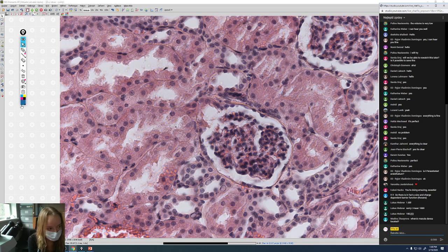And this is the renal body. And you can see on one side of the Bowman's capsule, which we described earlier, that there is something going right out of the Bowman space. And this is the beginning of the proximal tubule. So I'm going to add proximal tubule. And this pole right here, it's called the urinary pole.